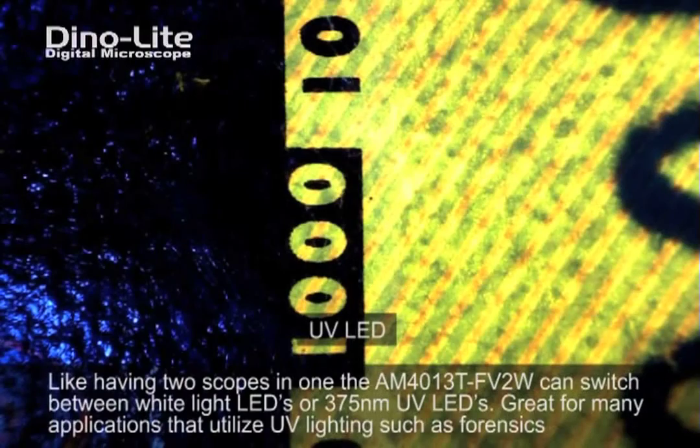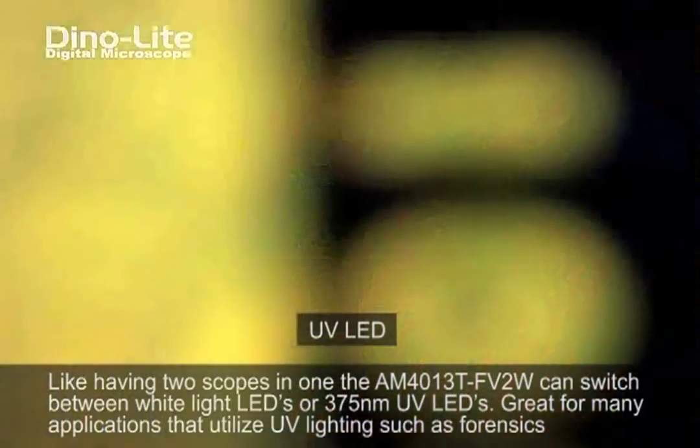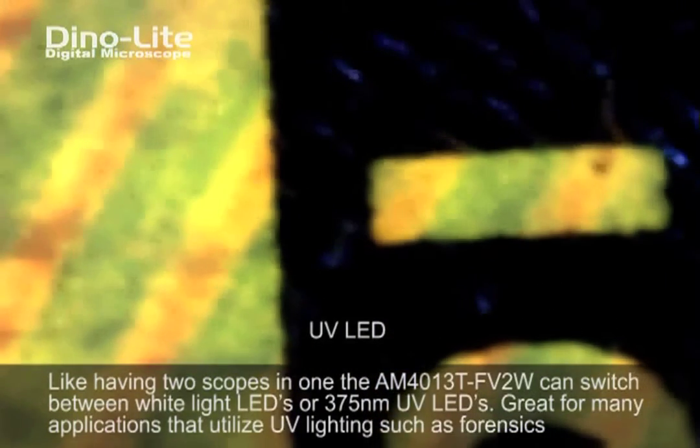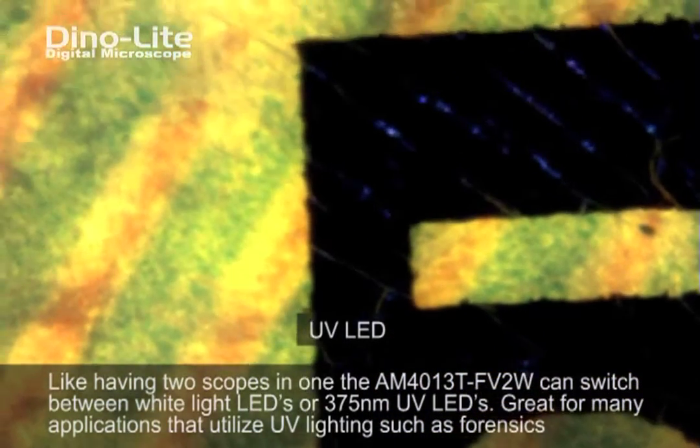Our newly enhanced UV filtering system provides improved fluorescence contrasting for use within the biochemical field, forensics, and/or machine vision, to name a few.